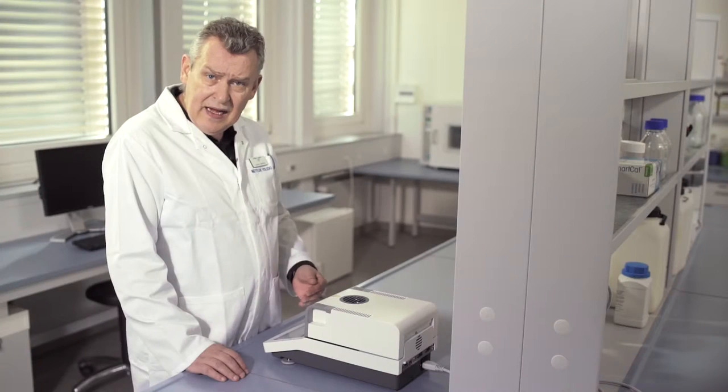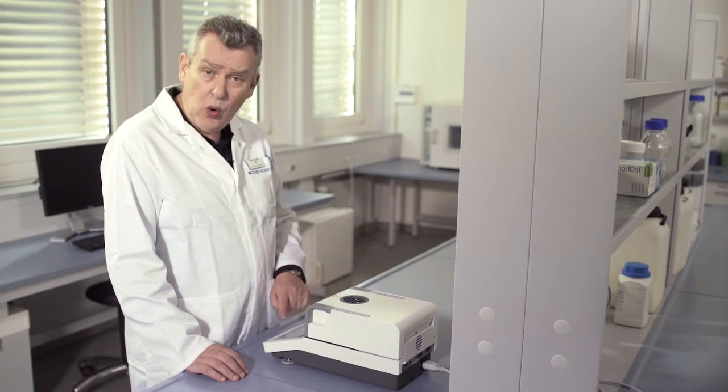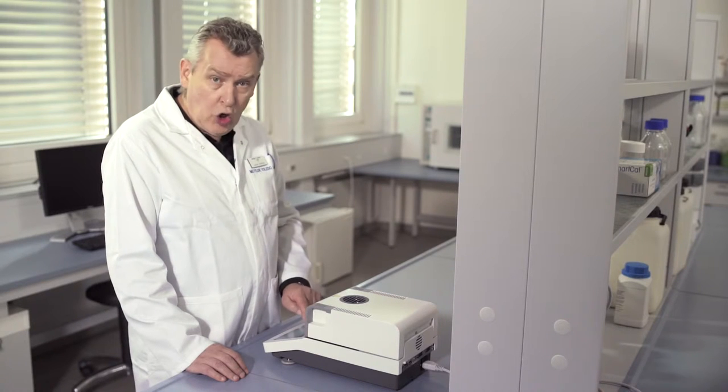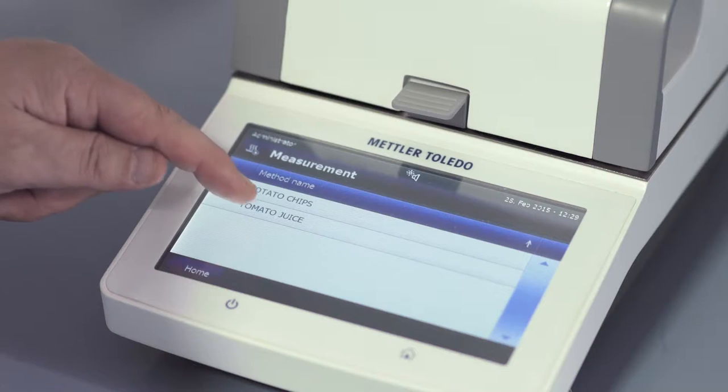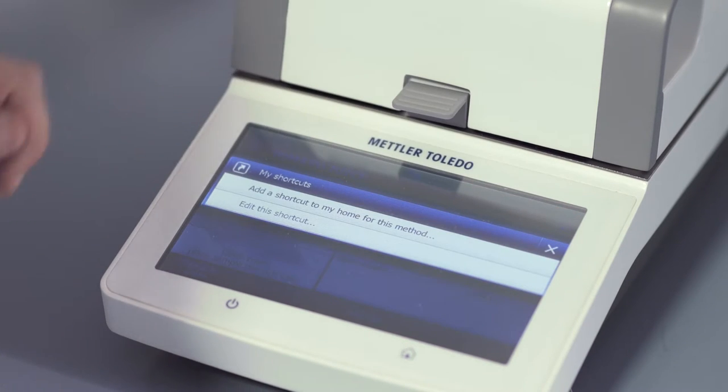For daily use of a method, it is recommended to create a shortcut on the home screen for quick and easy access. You create a shortcut by selecting the tomato juice method from the measurement menu, and then you simply press the shortcut button.